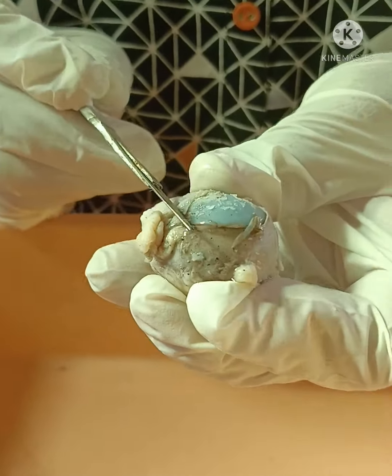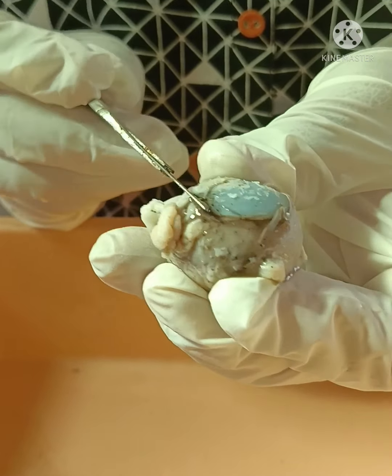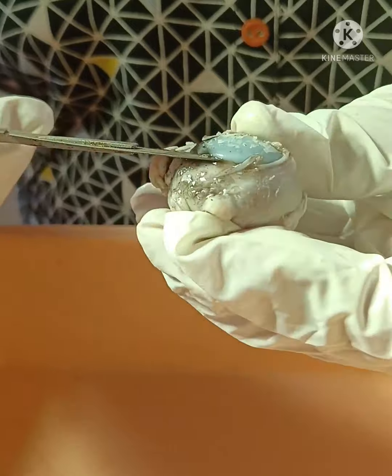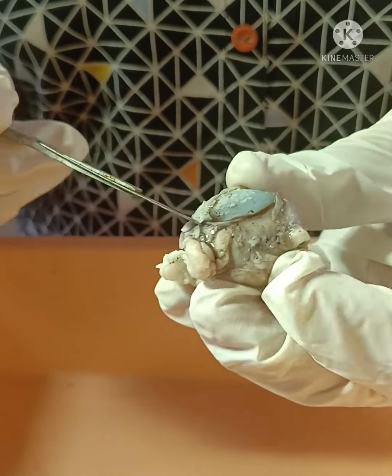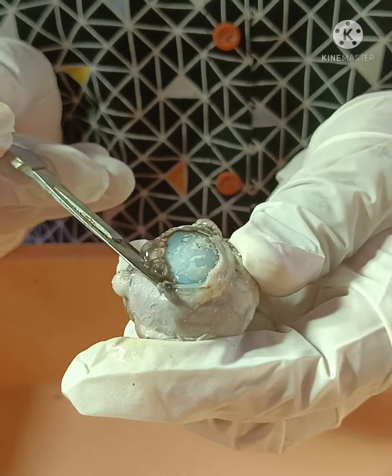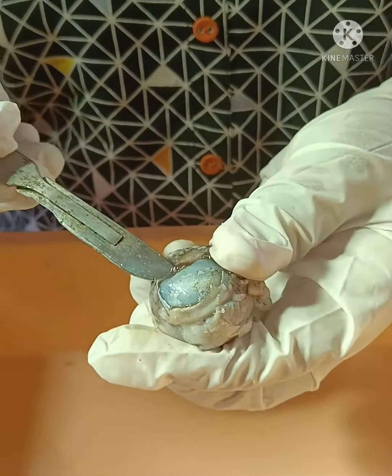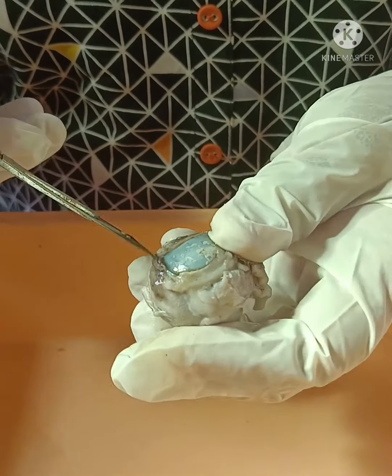Aqueous humor is a very transparent fluid. It occupies the aqueous chamber, that is the anterior segment of the eyeball.